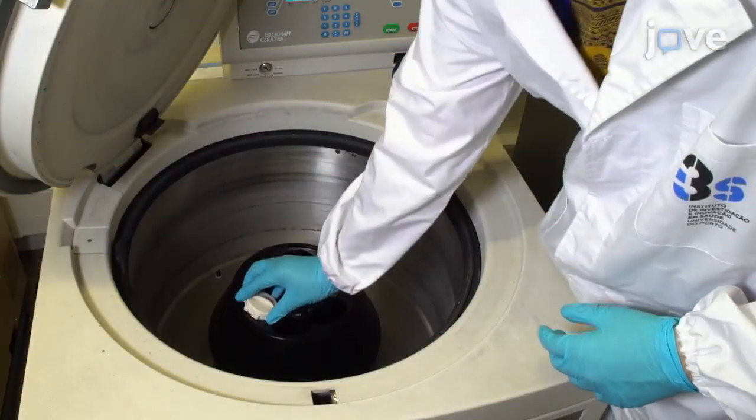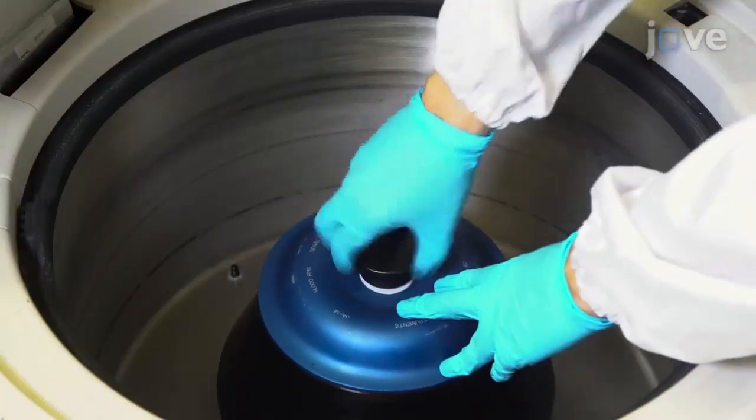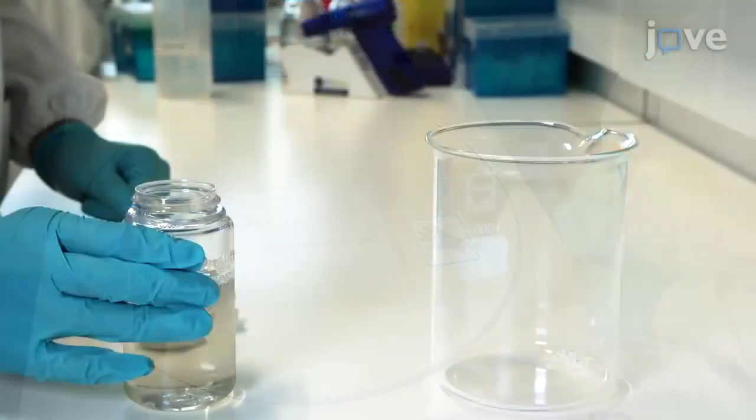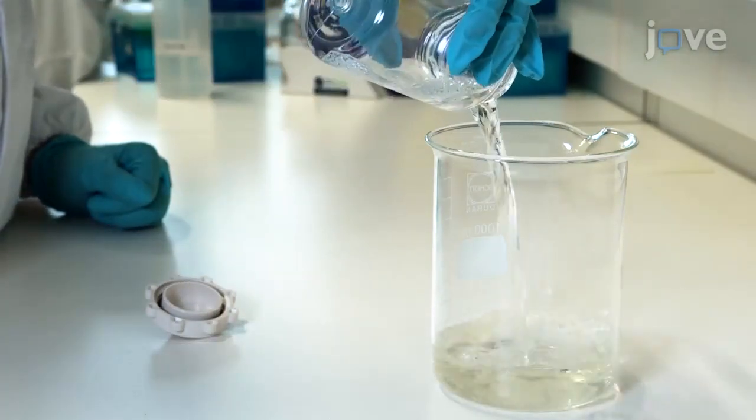Centrifuge again at 20,000 times G at 4 degrees Celsius for 15 minutes to remove contaminants such as cell wall debris or lipopolysaccharides. After the centrifugation, transfer the supernatant to a glass beaker and discard the pellet.